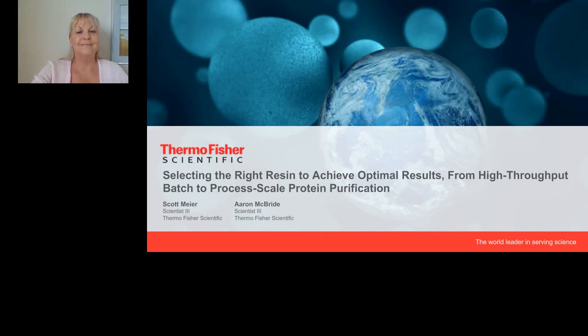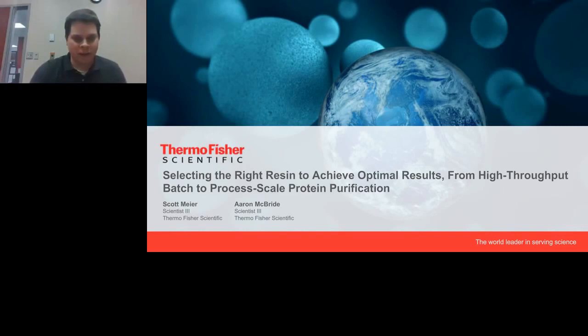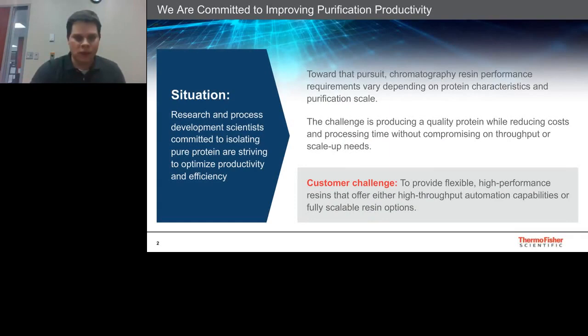Thanks for the introduction. My name is Scott Meier, and today my colleague Aaron McBride and I will be presenting a talk on selecting the right resin to achieve optimal results from high throughput batch to process scale protein purification. There's an increasing focus on protein research, whether it be for structure function studies, understanding interactions of a protein of interest, or the development of a potential biotherapeutic. This research requires efficient and effective isolation of pure protein at a variety of scales.